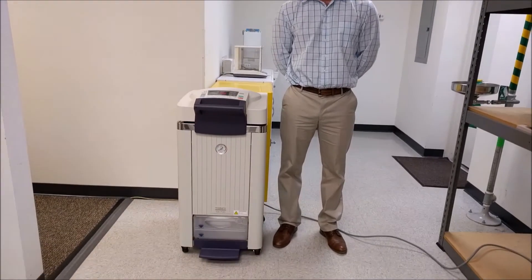Hello, my name is Pat with Amusa Inc., and today I would like to present the Tomy SX700 Portable Autoclave.